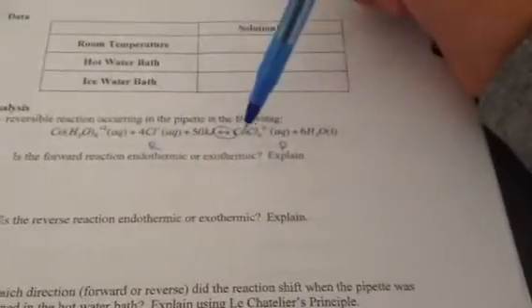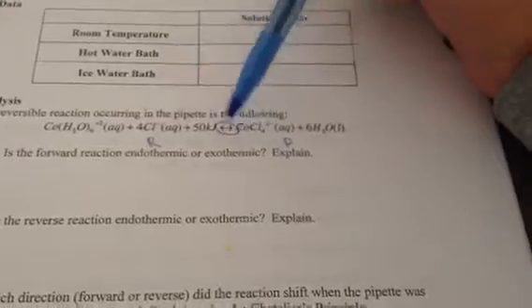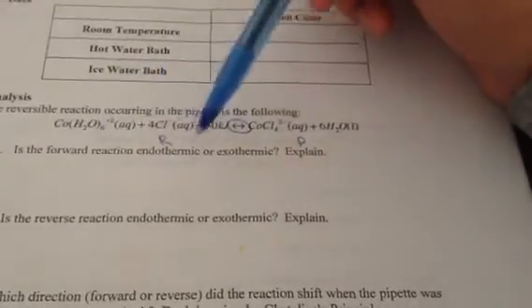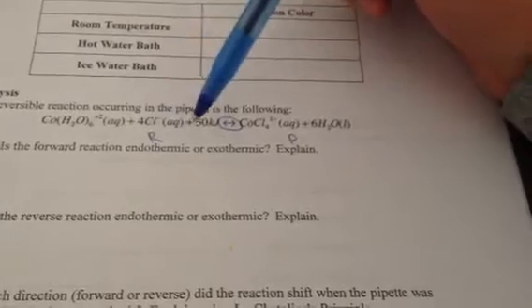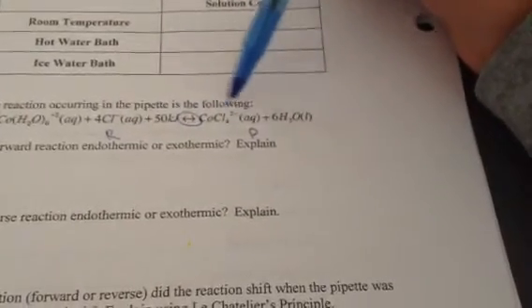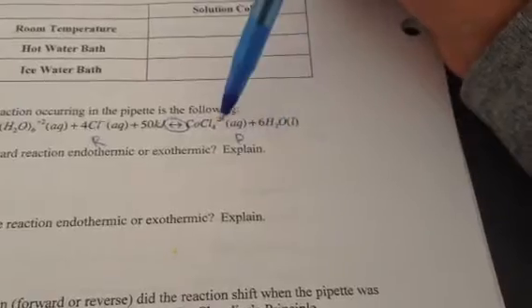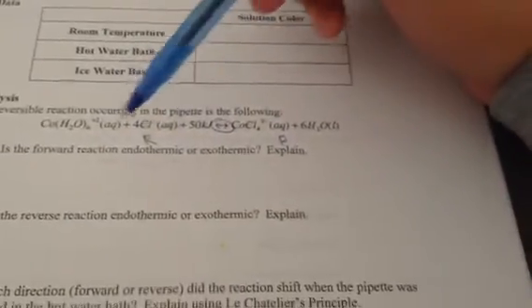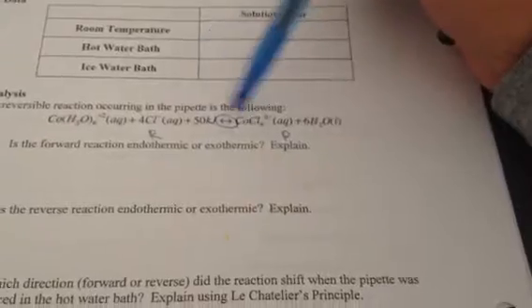So here's what's happening. In that test tube, we have a bunch of chemicals floating around. This reactant is getting used up and reacting, pushing forward to make a bunch of these products. But at the same time, we have a bunch of products reacting in the reverse way, going back to the reactants. So it's going back and forth right now.